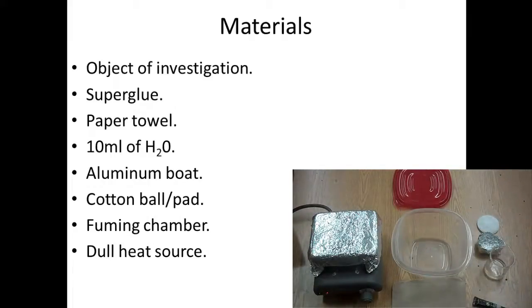I took a little bit of aluminum foil and I kind of made a little boat, I'm calling it, a little container. And inside that boat, we're going to put a cotton ball or a pad. We also need a fuming chamber and in this case, I'm just going to use a portable tupperware and some sort of dull heat source. In this case, we're going to use a hot plate set to very low with a piece of aluminum foil on top. But I've seen other people use a lamp or even a warm water bath.